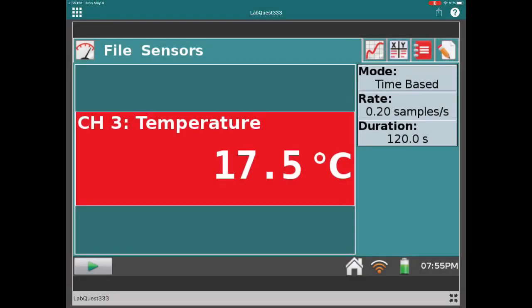We're looking at the second alcohol now. This alcohol is called N-propanol, sometimes also known as 1-propanol, or propane-1-ol with correct IUPAC nomenclature. You'll want to look up that alcohol online to get its chemical structure, write down its formula, and draw the molecule. You can see the temperature starting off a little bit warmer than before, because this alcohol has been sitting on the counter — the storage cabinet where we keep flammable liquids is a little bit cooler than the room.